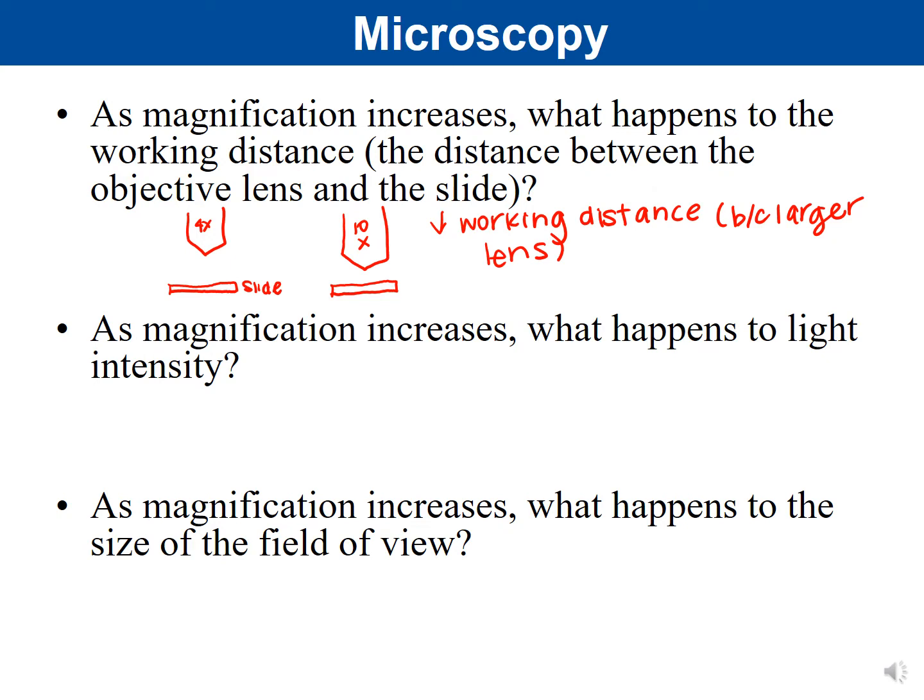Now, the reason that I bring that up is because the slide and the lens get closer, this is why you should only use fine focus when increasing magnification.